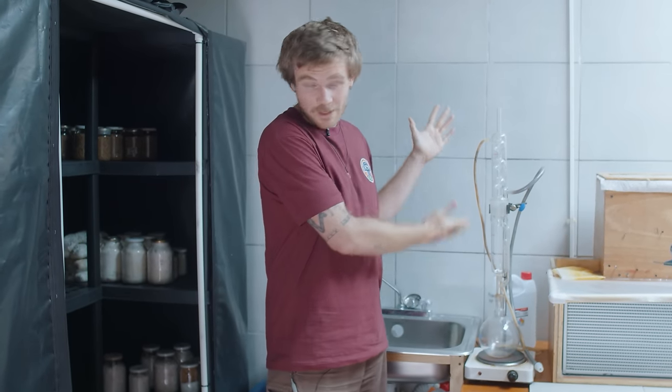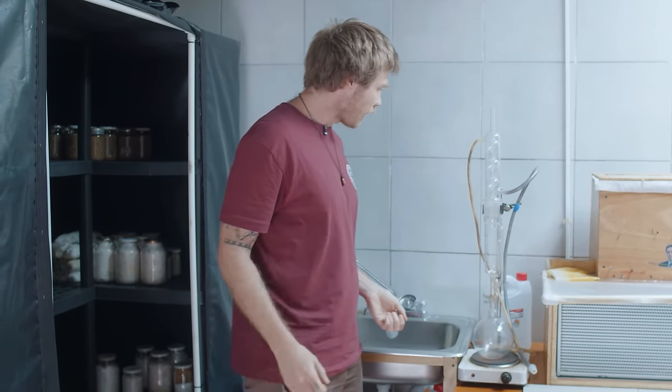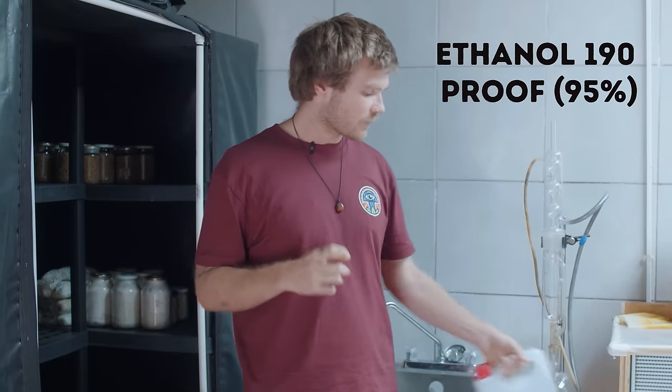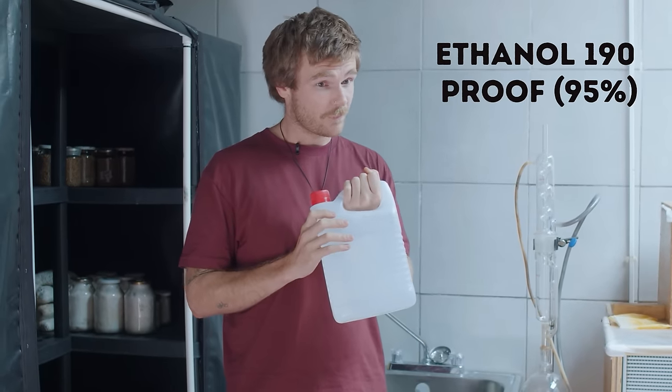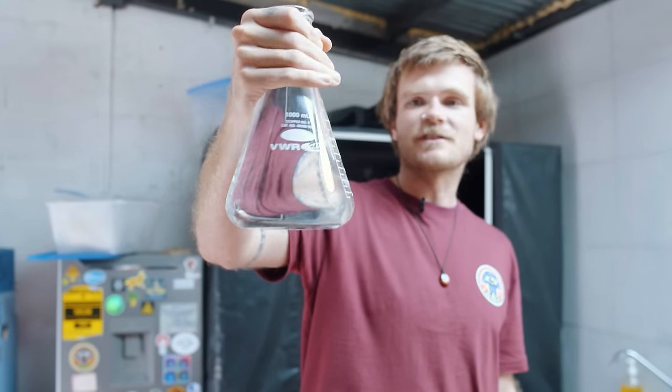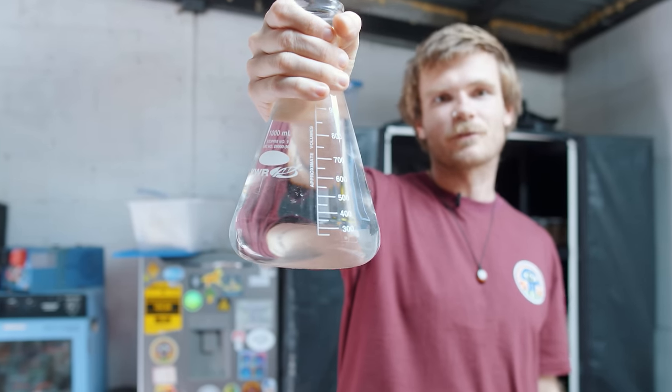You can get these on Amazon — we'll put a link. We have a half-liter Soxhlet with a liter flask. I know friends who are professional extraction businesses working with hundreds of liters, but for home use this is fine. For the solvent, you want 95% organic cane alcohol — ethanol, not isopropyl. Don't use isopropyl; it will kill you or make you blind.